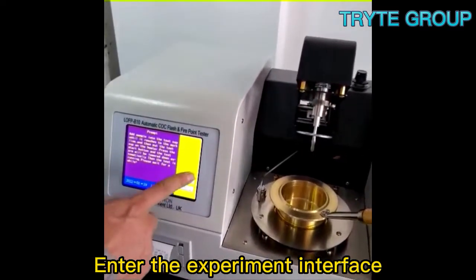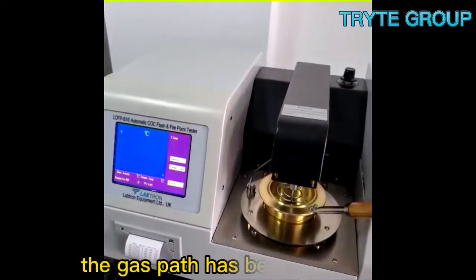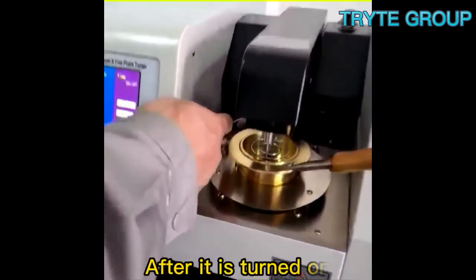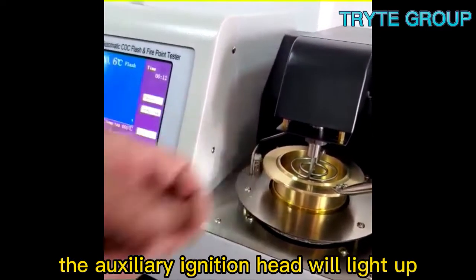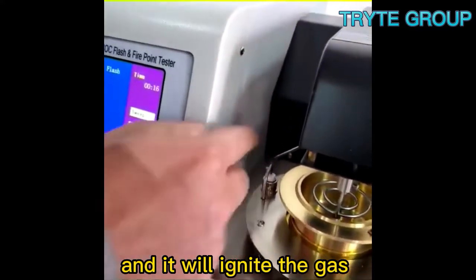Enter the experiment interface and start the experiment. The gas path has been connected, and there is a valve at the back. After it is turned on, the gas path will reach the front. After one minute, the auxiliary ignition head will light up and ignite the gas.